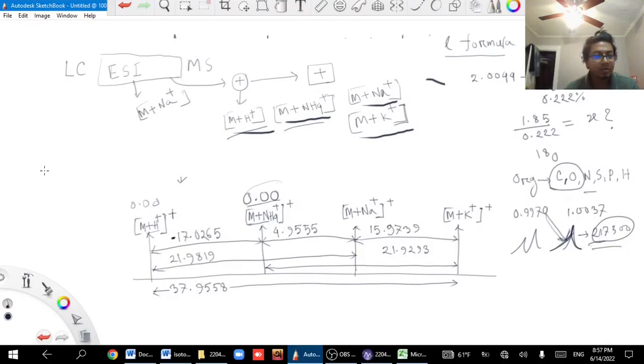So listen, what we got here. This mass, 340.1389, is the M plus NH4 peak, right?